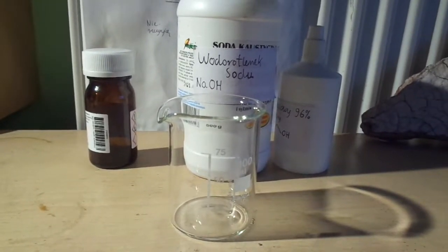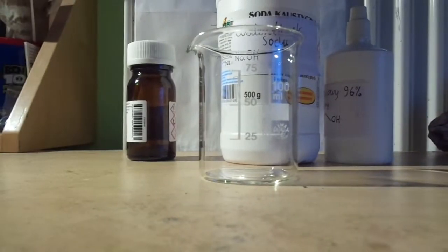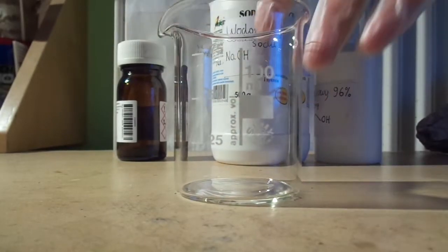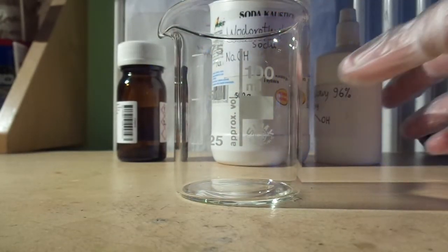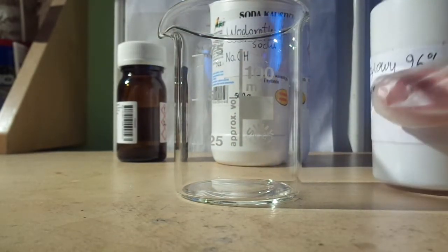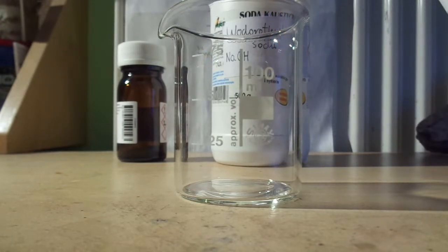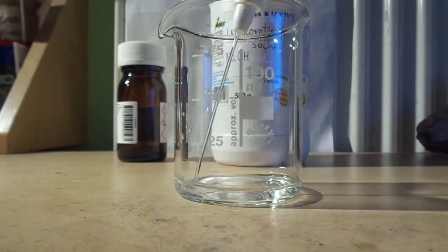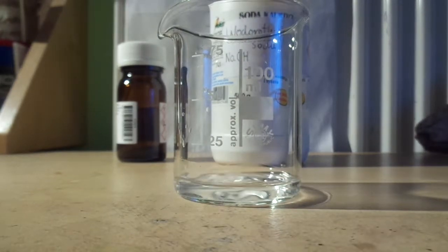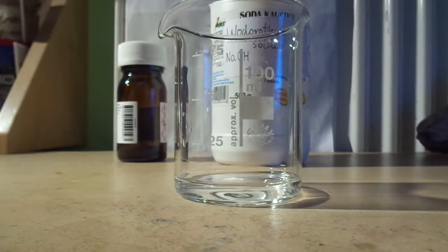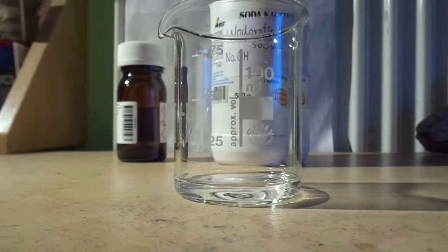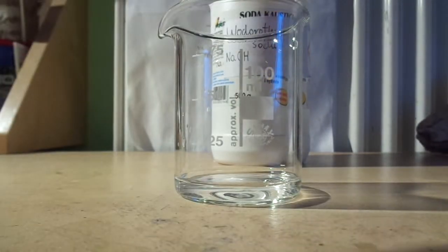Today I'm going to make iodoform, which is an organic compound of iodine. To make it, you first need to dissolve some iodine in ethanol. I'm just going to take some ethanol, this is 96%, so I'm basically going to make a tincture.